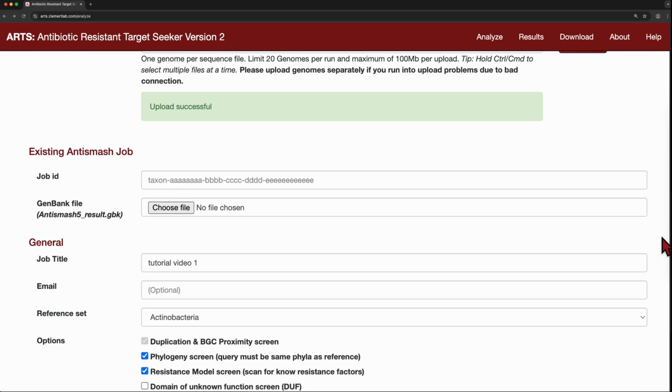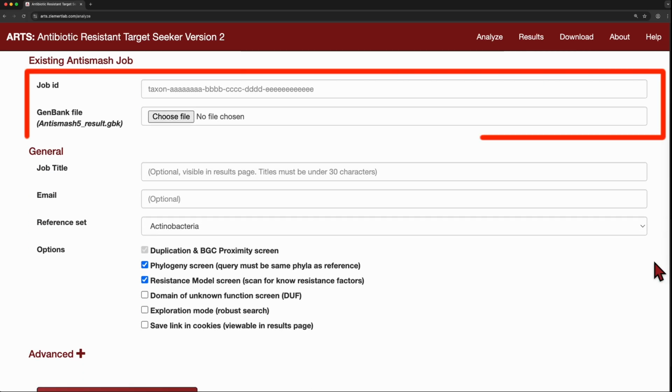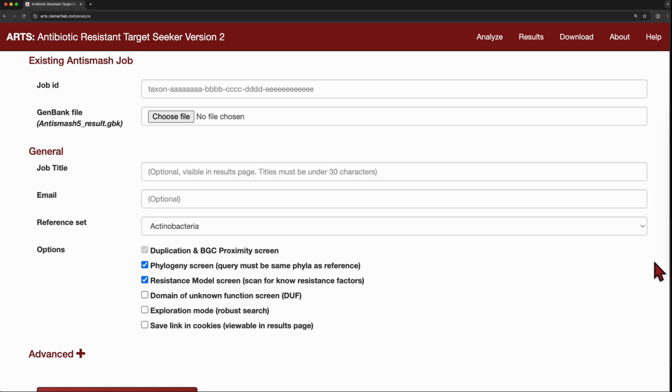If you already have antiSMASH 5 results, you can upload those directly to save some runtime. In the General Settings section, you can enter a job title. We'll call this run Tutorial Video 1. You can add your email address to get the results link via email.